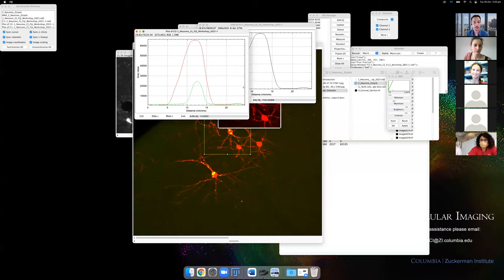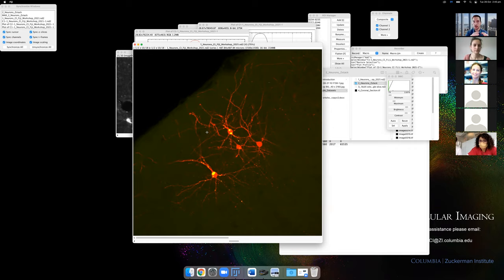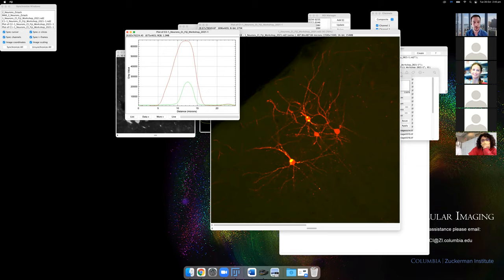When you make the line thicker, it samples across all the pixels within that width rather than just one pixel. This is particularly useful when tracking protein trafficking along a dendrite, which is probably more than one pixel wide — making a wider line samples the whole dendrite very easily.